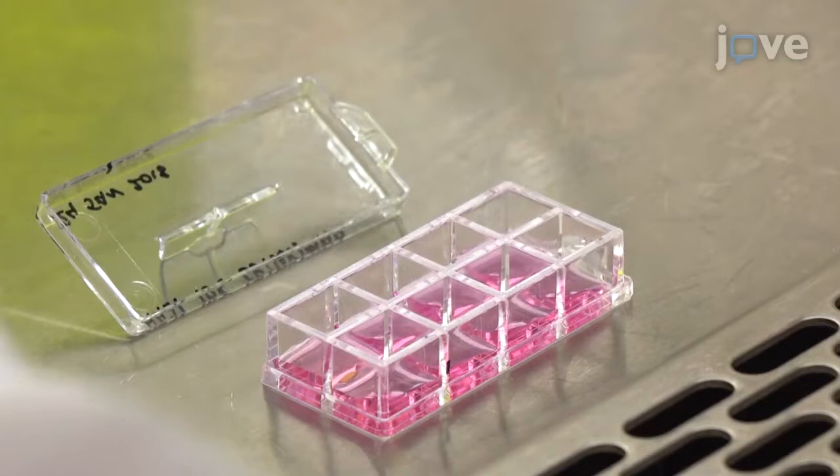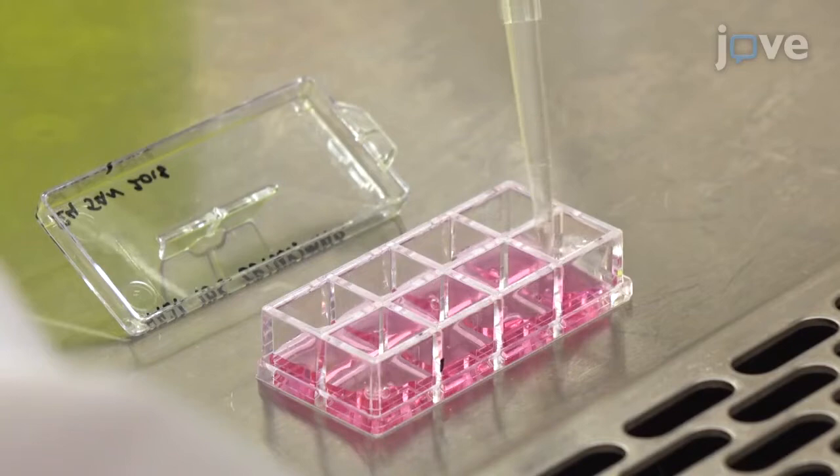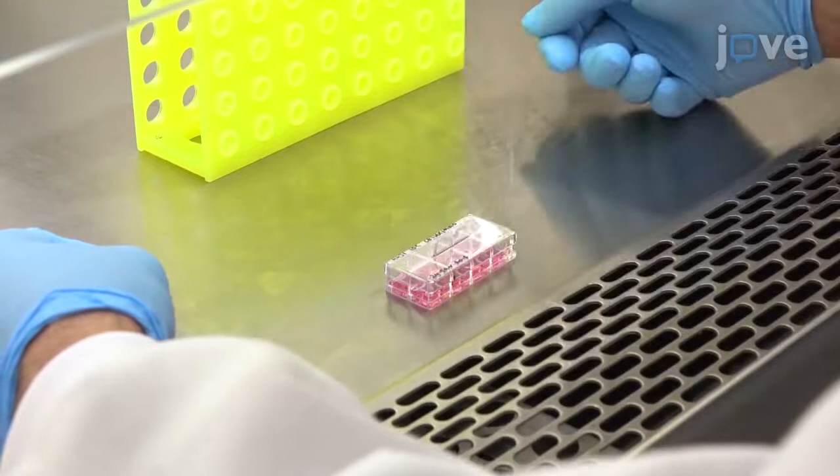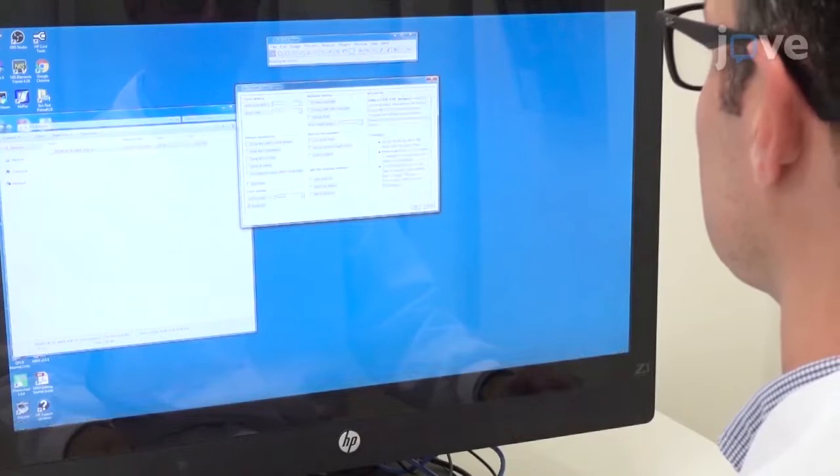The next day, add 100 nanograms per milliliter of EGF ligand in media to the cells in order to stimulate EGF receptor aggregation. Incubate the cells with the ligand at room temperature for 10 minutes before fixing them.